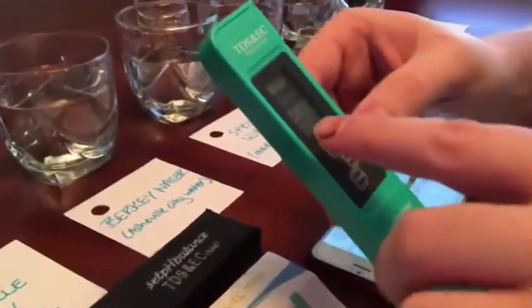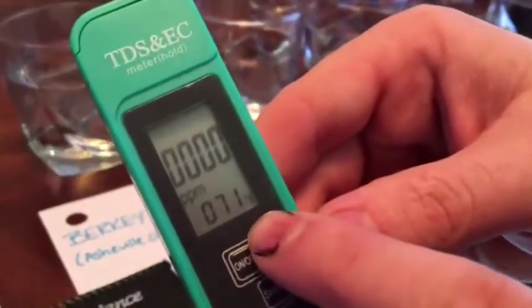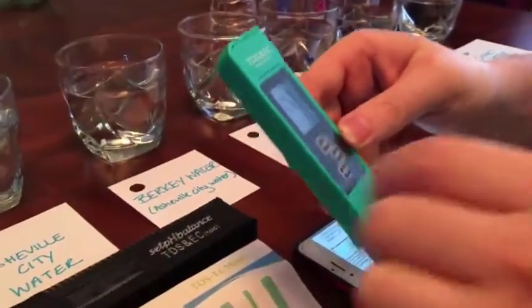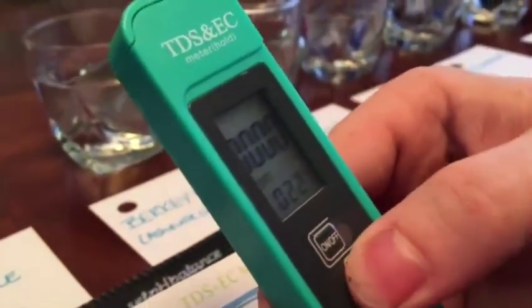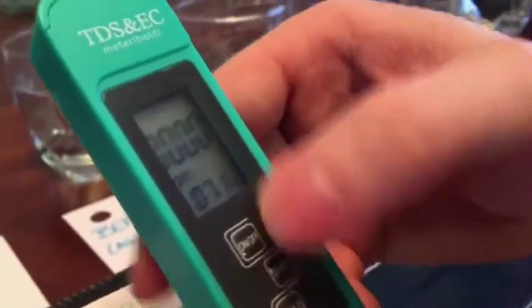We turn it on and we're already in total dissolved solids mode — you can tell by the PPM reading, and it's also giving us a temperature, which is a nice feature. We can hit the shift button to change to EC mode, which measures conductivity and salt content, then shift again to go back to PPM in Celsius.